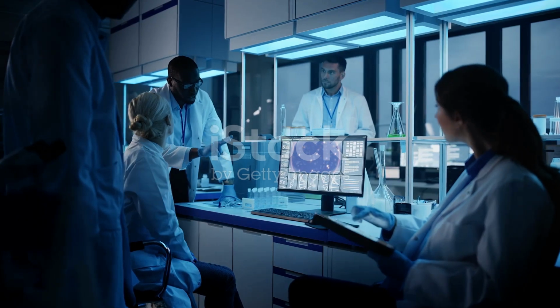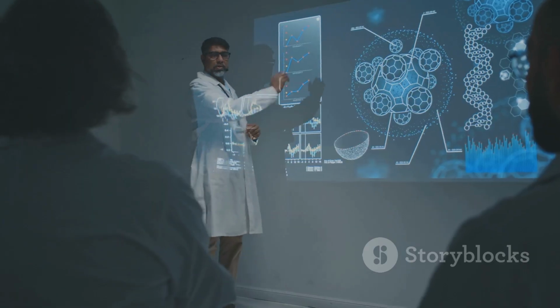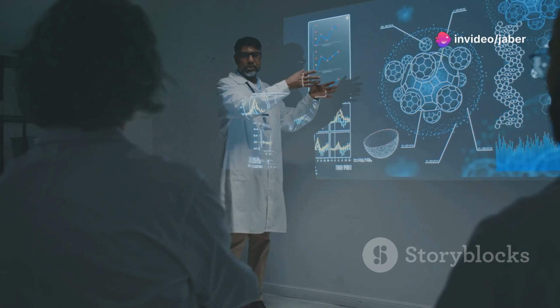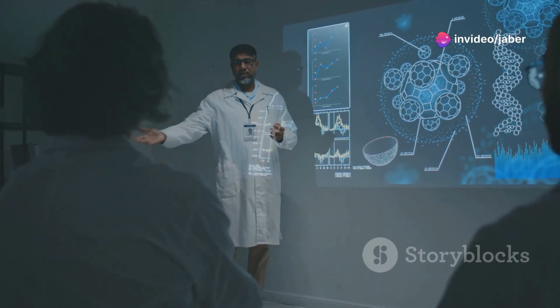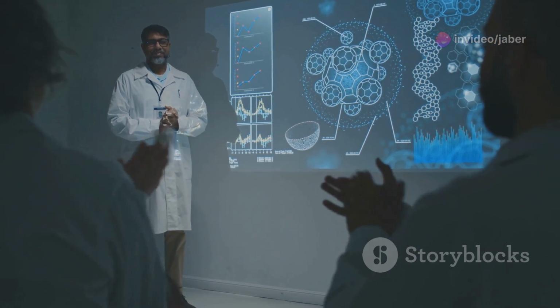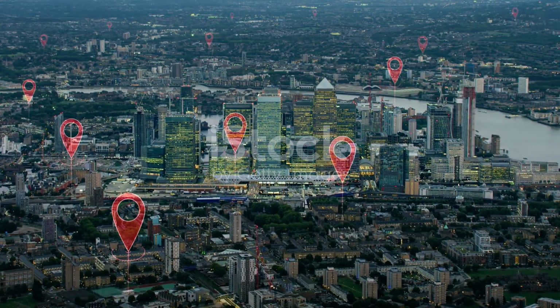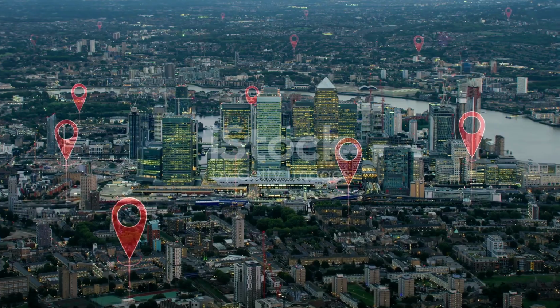There are several normalization methods available, each with its own strengths and limitations. Let's explore some of the most common ones: total count normalization, reads per kilobase million, fragments per kilobase million, and transcripts per million. TCN is like dividing the population of each city by its total area to get the population density.